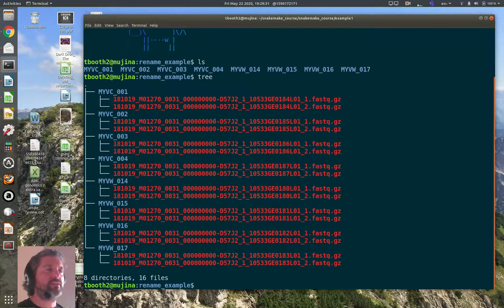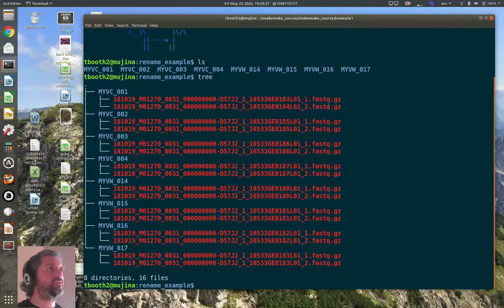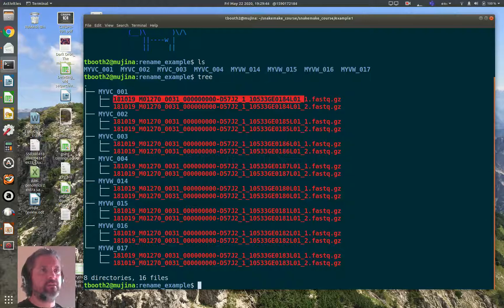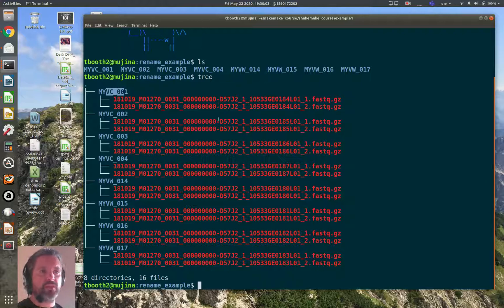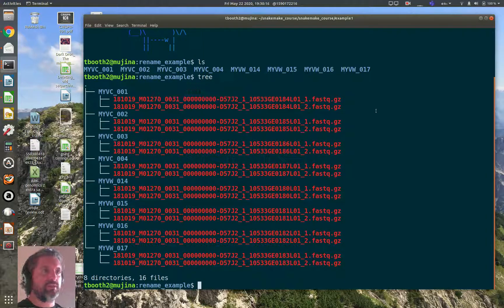Using the tree command instead of ls, I can see down into those directories. Each sample directory contains two fastq files, number one and number two, because this was a paired-end sequencing run. The actual file names from the Edinburgh Genomics data delivery are long and meaningless to most people — they contain information about the sequencing run. But what we really care about for analysis is the sample that was sequenced, so we want to rename these files and give them names that incorporate the sample name.